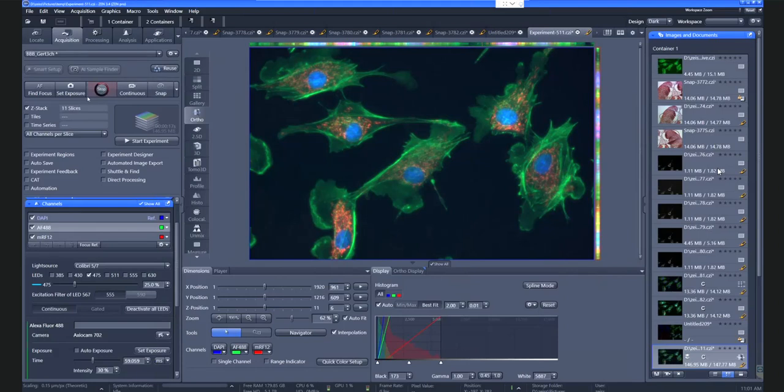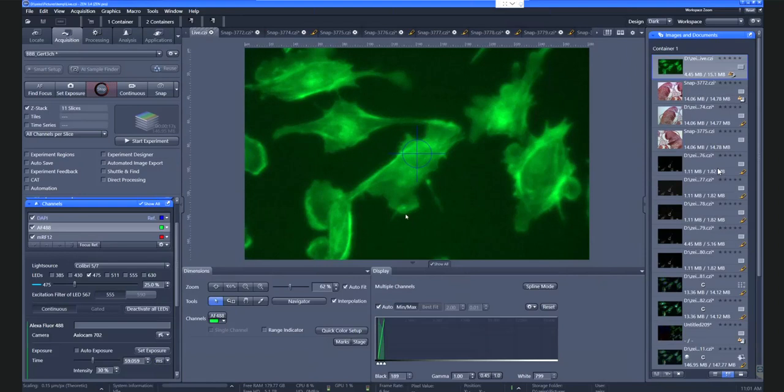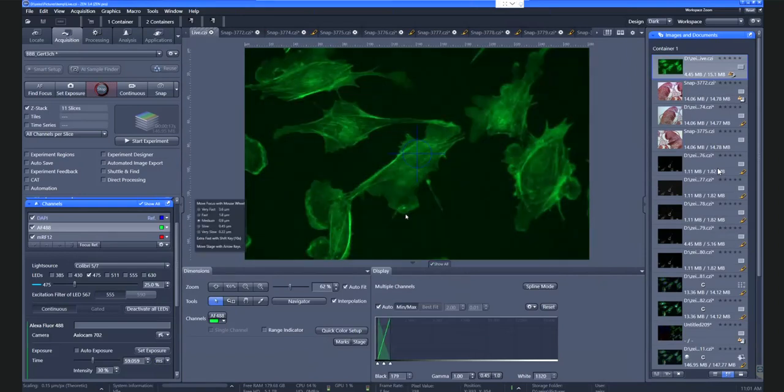Okay, so live allows me to quickly work in that live window, quickly move and focus and adjust things. And live is really like something like a video camera would do. You get permanently updated, but with some different settings. So the camera is streamlined a bit in live mode to give us a bright image. The camera is reduced in the number of pixels, and we are using some gain in the background to enhance the image.